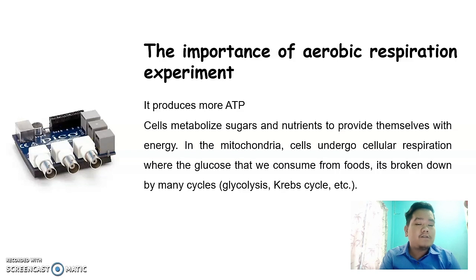Of course, this instrument is important for aerobic respiration experiments because it produces more ATP. And here's some brief explanation about aerobic respiration. So the cells metabolize sugar and nutrients to provide themselves with energy.